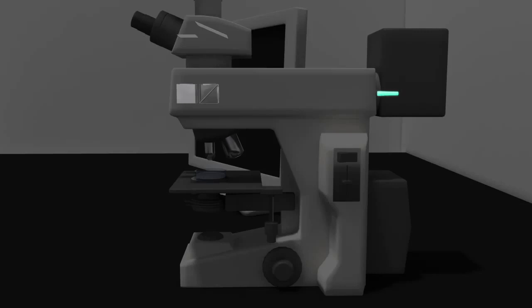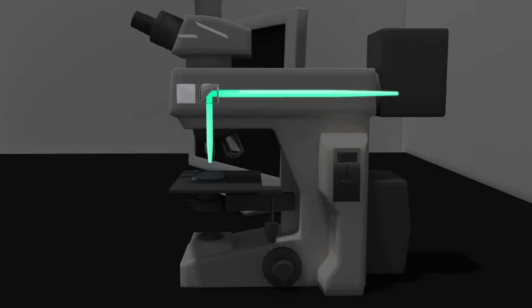From the laser light source, the excitation laser beam travels through the filter cube, which is used to provide the appropriate wavelength of light to excite the fluorescent molecules, or fluorophores, used in the sample, then through the objective to focus the laser light on the sample.